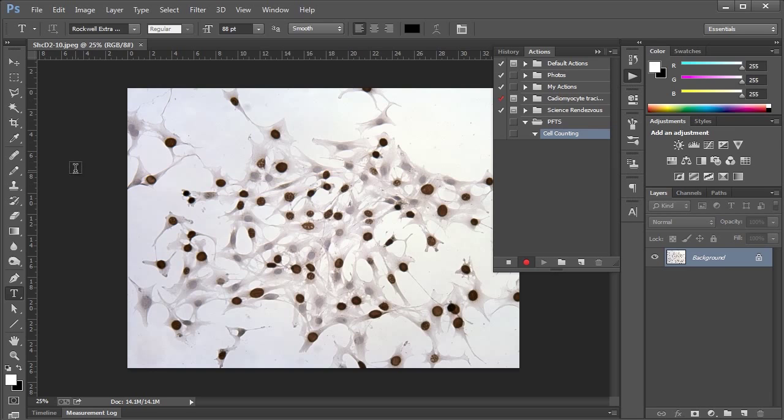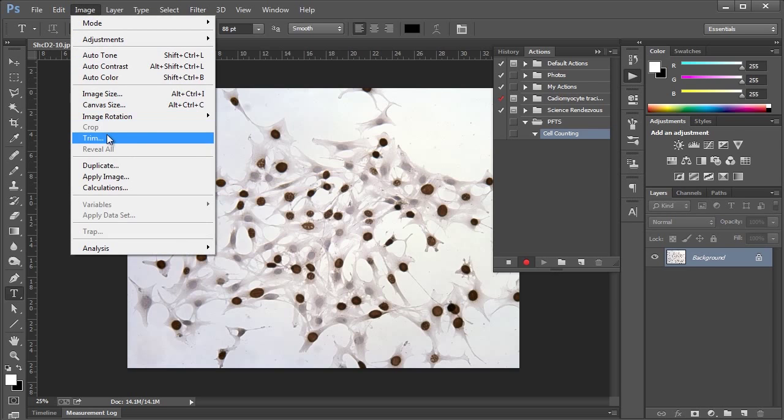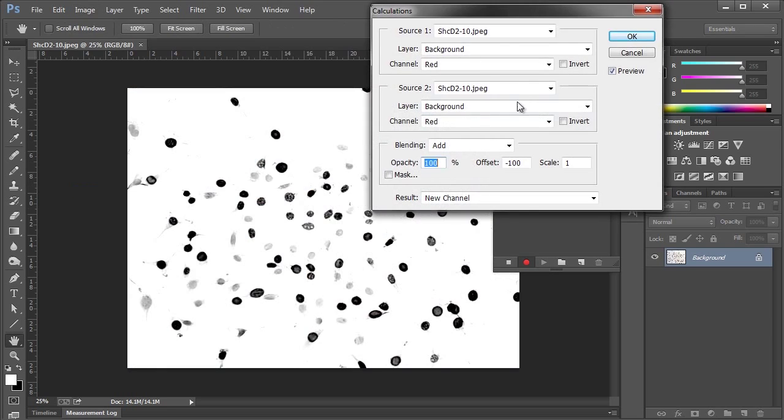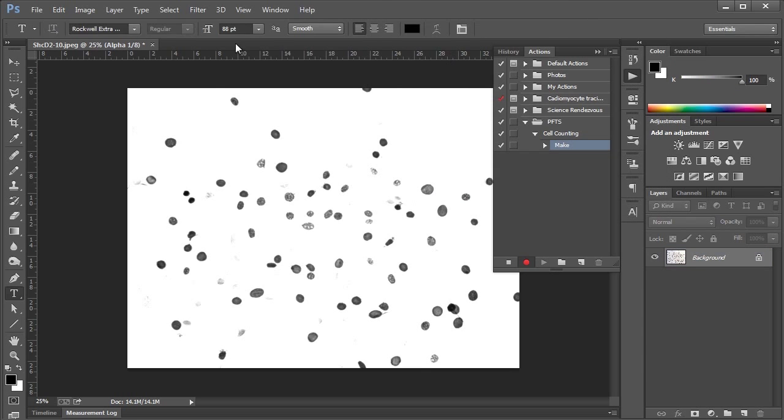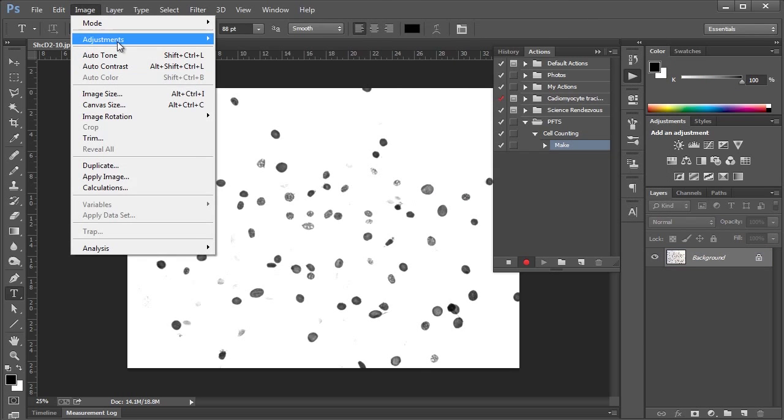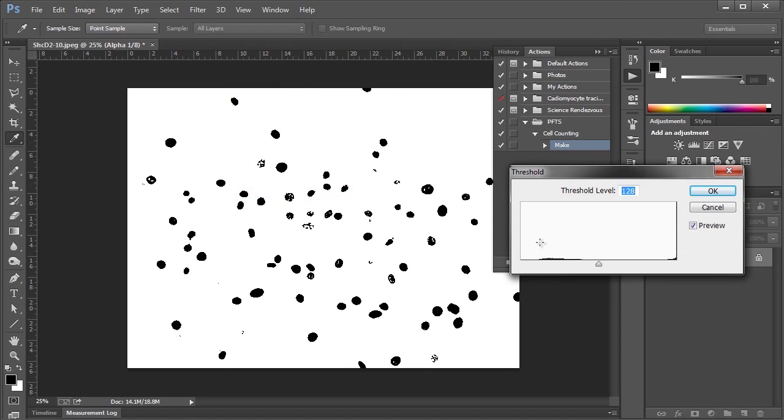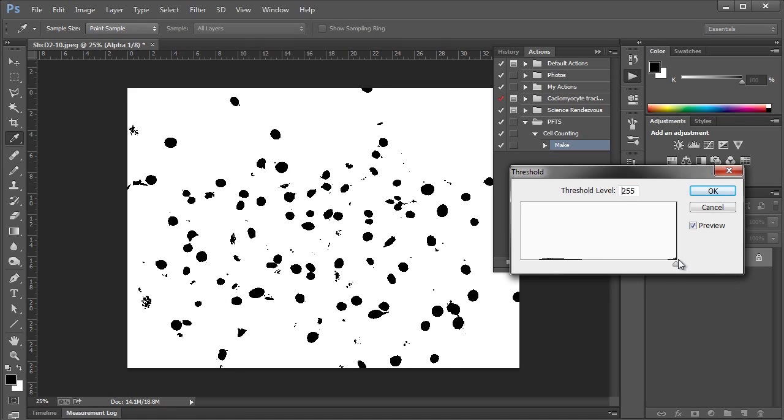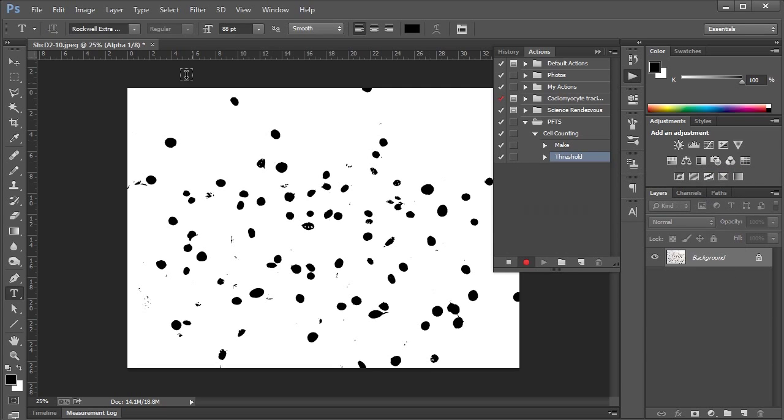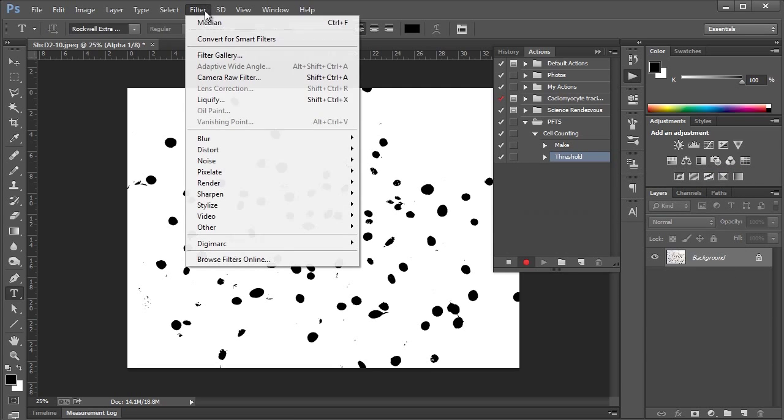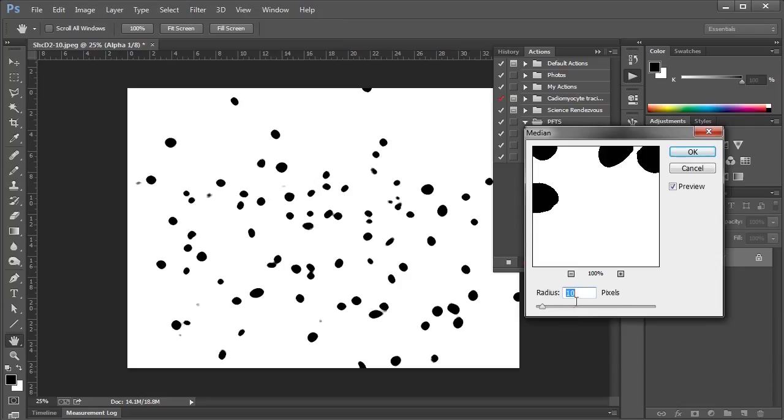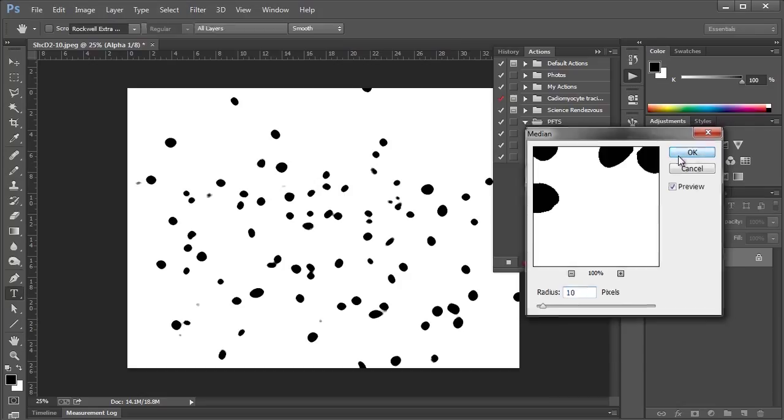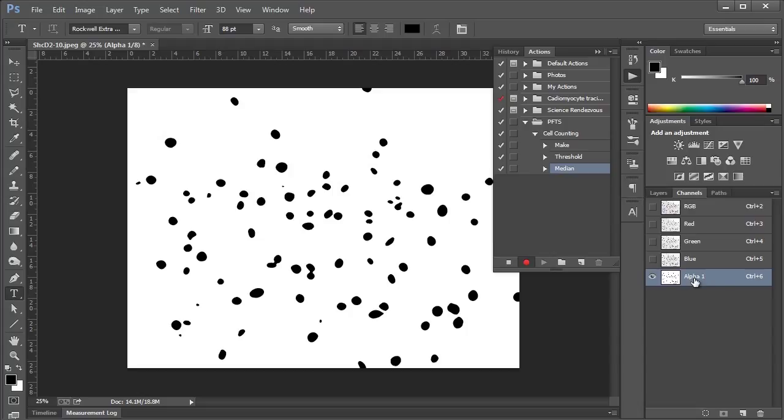So all we need to do now is just click the tools that we need to use for cell counting. So if you remember from the previous video, and I'm going to go through this pretty quickly here, we'll choose Image, Calculations, we'll choose Red and Blue, set the offset to 0, click OK. We'll use Image, Adjustments, Threshold, crank this up, get rid of the specs, 230 looks good to me. Let's say Filter, Noise, Median, Radius set to 10, good, looks pretty nice.